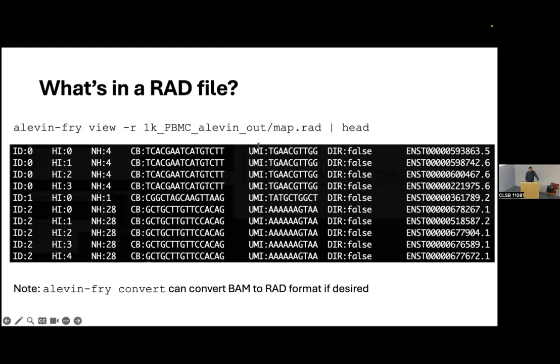In practice, I have found some variability sample to sample where the number of cells that it calls by default as quote unquote real are smaller than what Cell Ranger may report for the same sample. Both for Cell Ranger and for Alvin, you can specify a parameter called expect-cells, and you can just give it whatever number you think might be there.